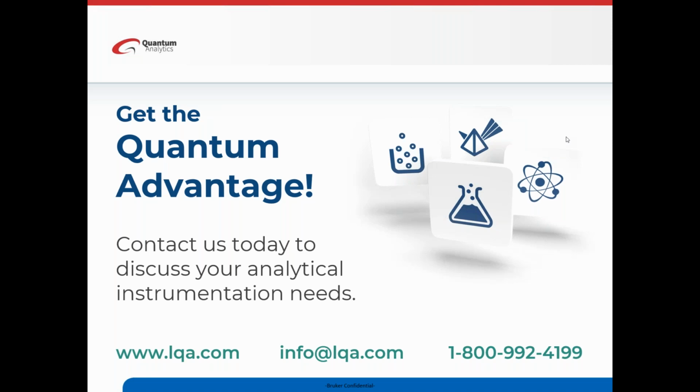Fantastic. And the next question I have here is, are library searches always effective? Yeah, that's the $24,000 question people always want to know. And the answer is, the library is as good as the information you put in there. So if you are doing true unknowns, it's really tough to actually purchase a library that's going to cover the full breadth of everything that's ever been made. So what I normally recommend is for you to build a library of your own of the things you see most often, the most common contaminants.